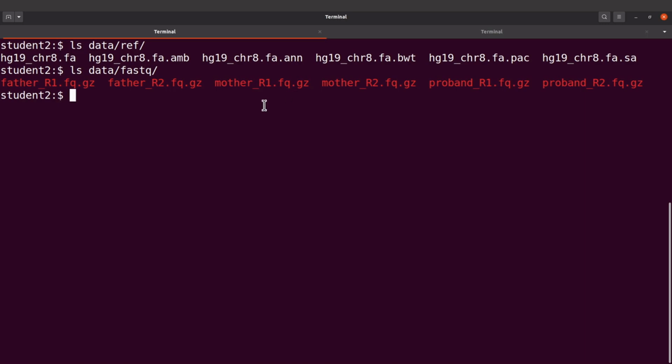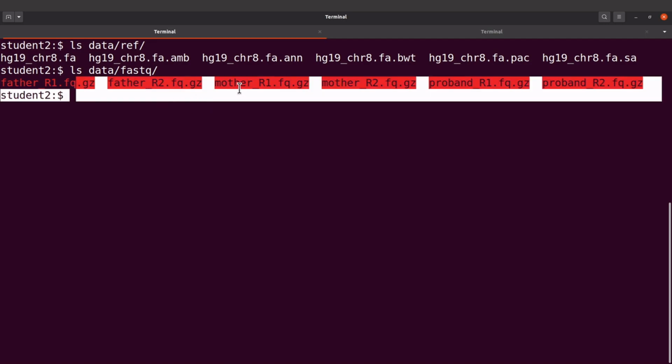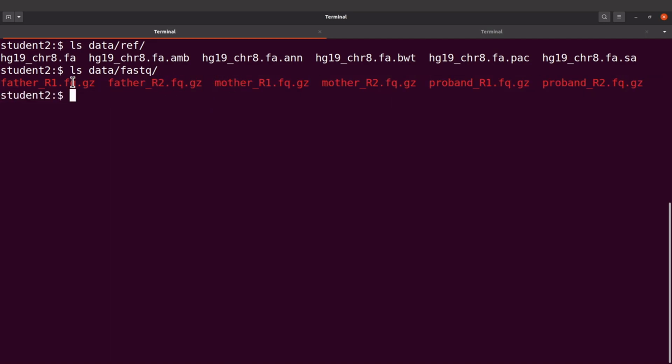So this is where we are going to write a bash script to map the array. So each of the samples will be taken and then mapping will be done. So this is where the automation starts. And in principle, you can apply whatever I'm doing here to your own data set, provided you have the right naming convention. So let's start.